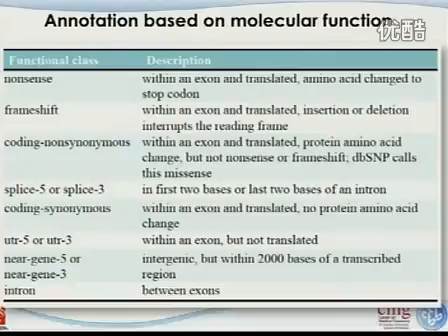That is correct, and that's because when they designed those chips, those regions are not included. But actually, those are also considered part of the exon. So the terminology becomes a little confusing, but they are just not on the chips. Sometimes they are not translated into the protein product, but they are doing a lot of translational regulation, or at least post-transcriptional regulation.